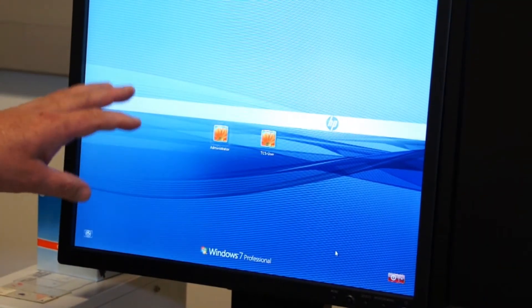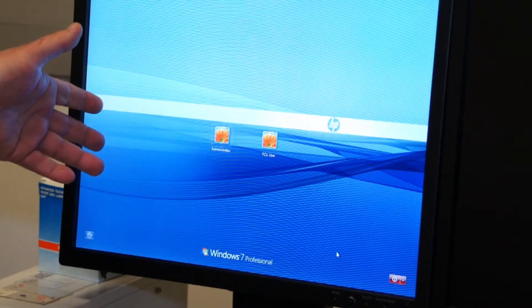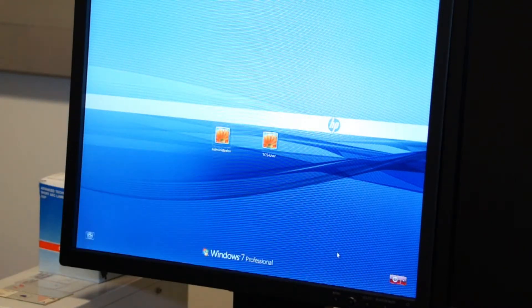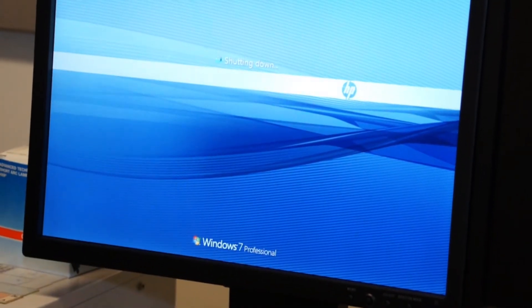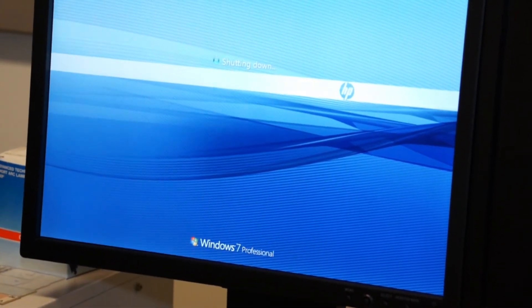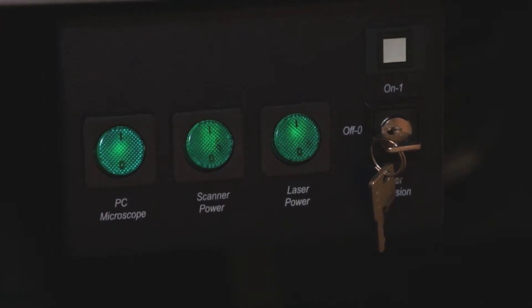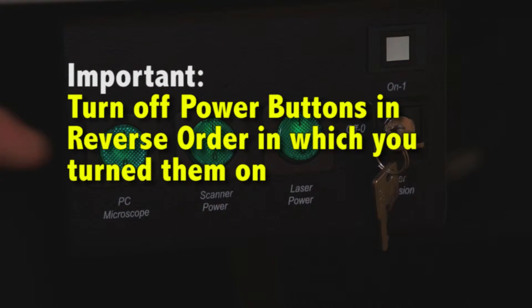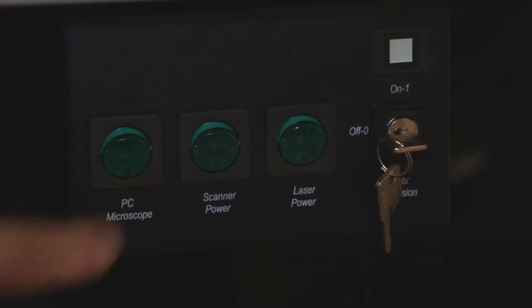Because the main power to the system also turns on the computer, Windows starts by itself. Therefore in shutdown, you must first close Windows before you can turn off the power to the system. So we close Windows and wait until it shuts down completely. To turn off power to the system, depress each button in the reverse order to which you turned them on — from right to left until all the power is off.